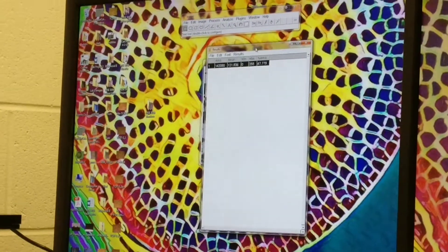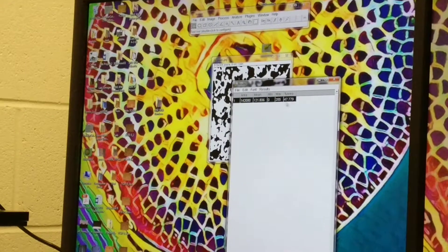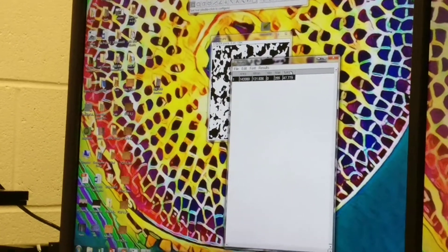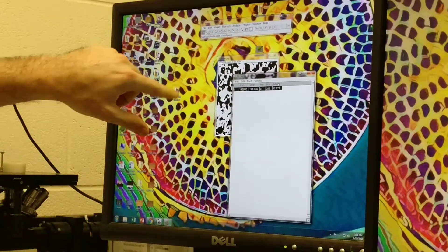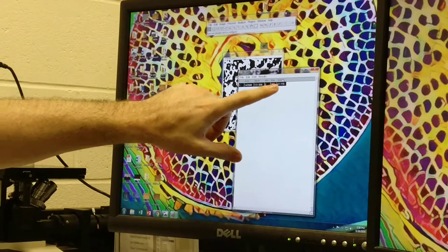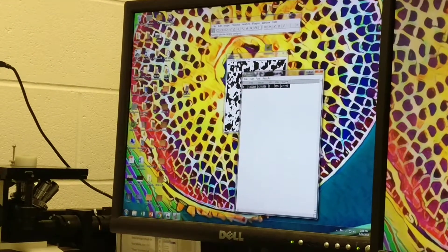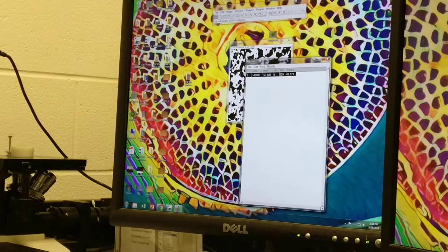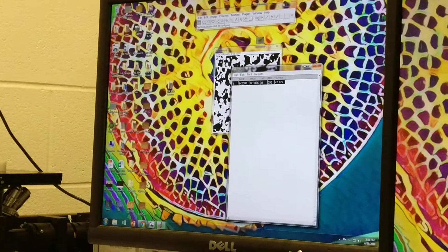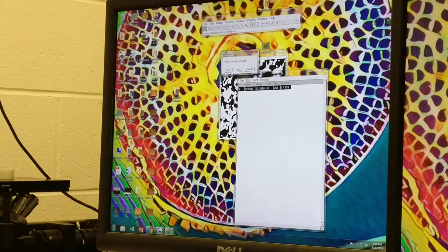In this results window we'll see the area percentage here, and this is calculating the area fraction of that image that is black. This says 47.7 percent, so that's the area. We can do that several times for images and average them if you're actually doing research.